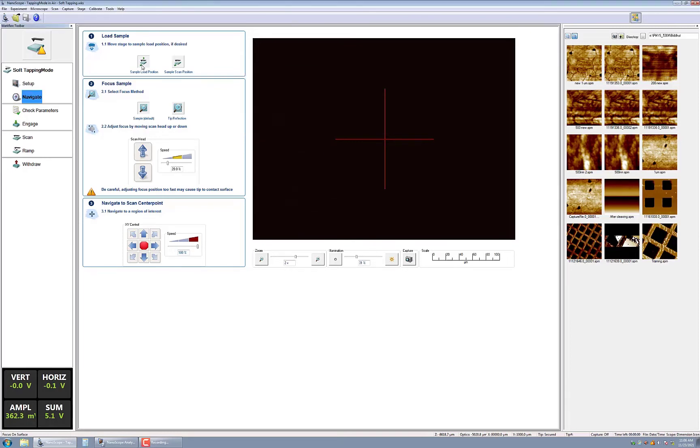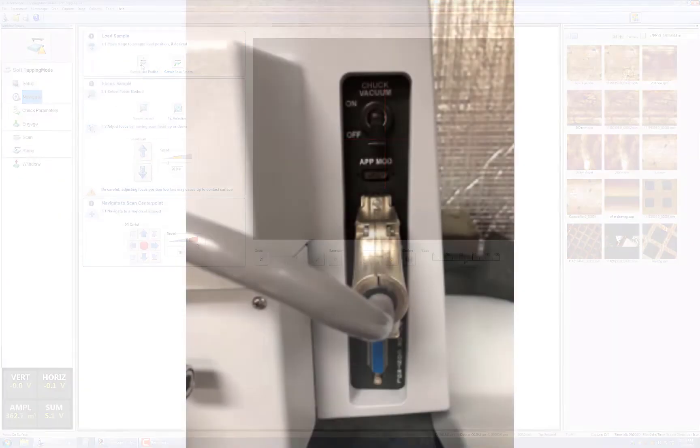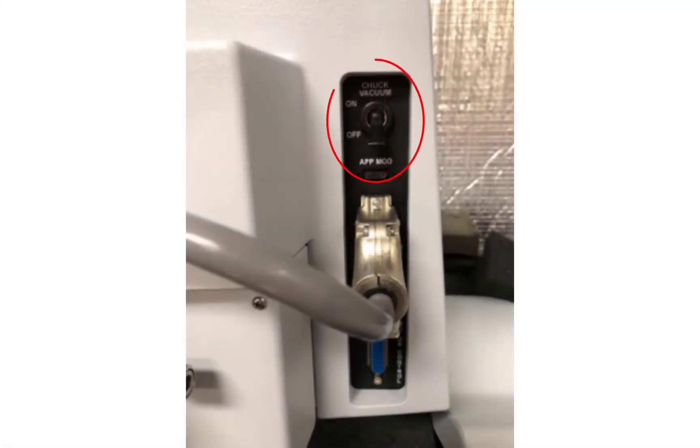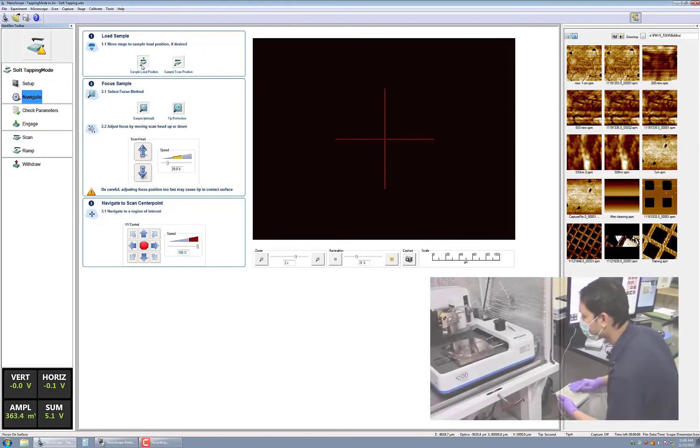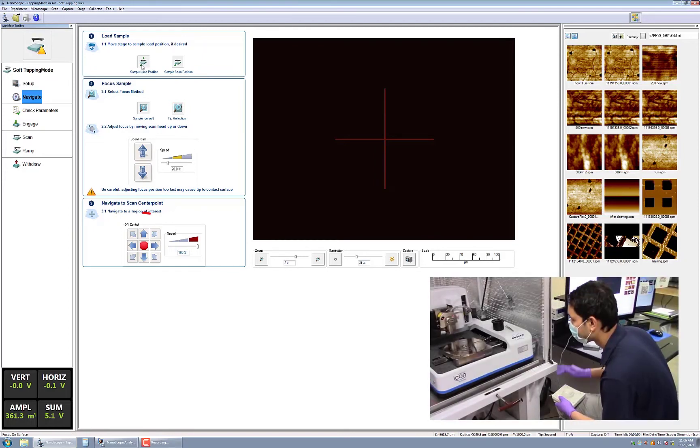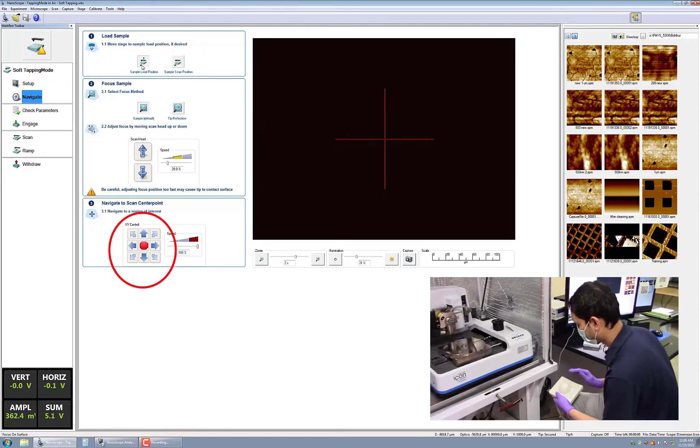The magnetic chuck is designed to accommodate samples that are mounted on metal discs. The vacuum chuck allows for flat samples to be placed directly on the stage and secured by vacuum using the switch, as shown here. Once the sample is secured, you can translate the stage so the sample is positioned underneath the scan head. The stage can be moved by either using the track ball or the directional arrows on the software.